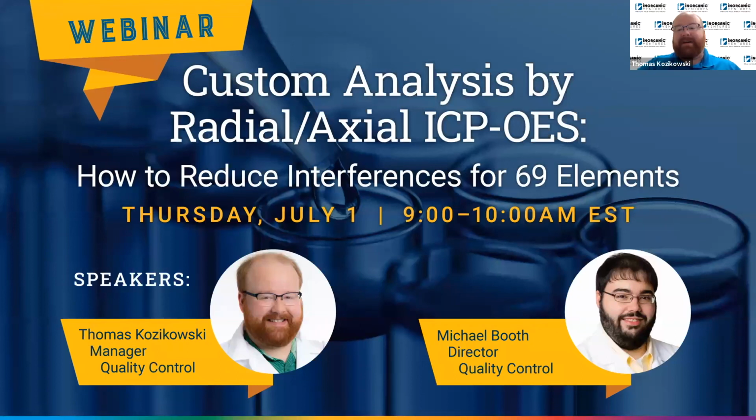All right, thank you, Brian. Welcome to our July webinar. We're going to go into some details on the method that we use here at IV routinely in QC for testing all the custom standards that you all purchase from us.